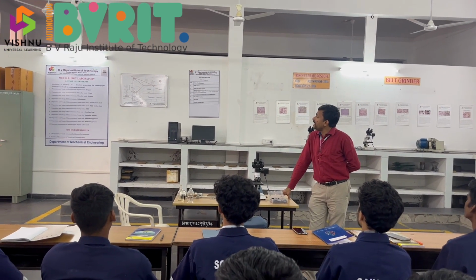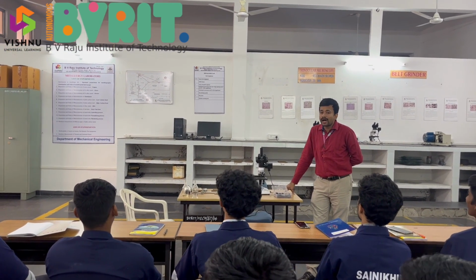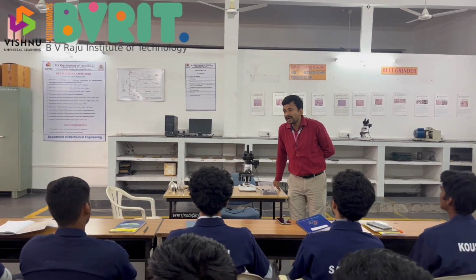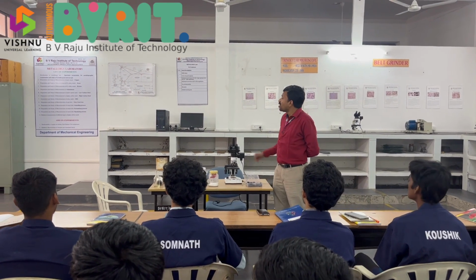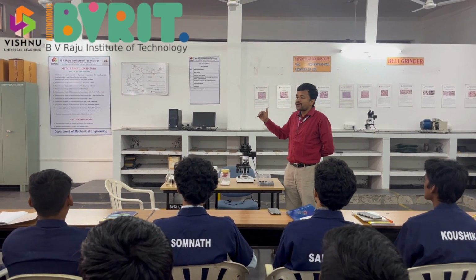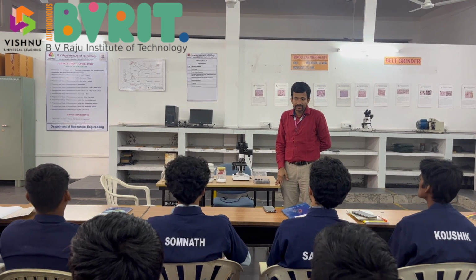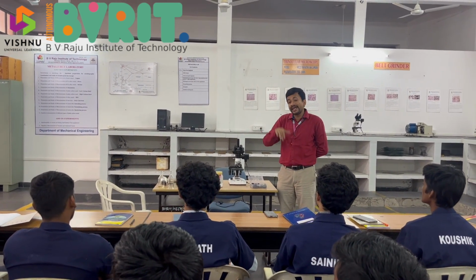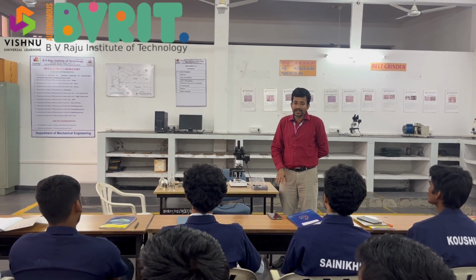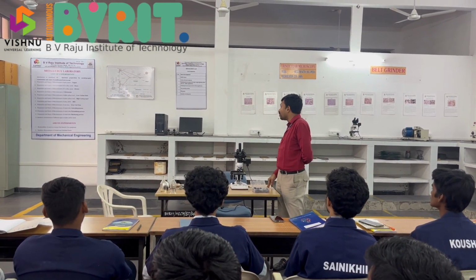So up to 8, if you see, all are either a ferrous metal or a non-ferrous metal, right? So copper, brass, bronze, aluminium come under non-ferrous, and low carbon, high carbon, HSS and grey cast iron come under ferrous metals. I'll explain what is what and all.